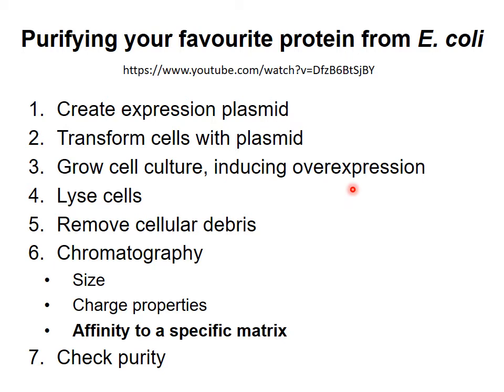When you have a lot of the cells, you collect them and then lyse them, or break them open. You often break cells open using physical methods that disrupt the cell wall and cell membrane. You then usually do a centrifugation step to remove the remnants of the cell wall and membrane, after which you are left with a complicated mixture of all the soluble proteins and other molecules that were in the cell.